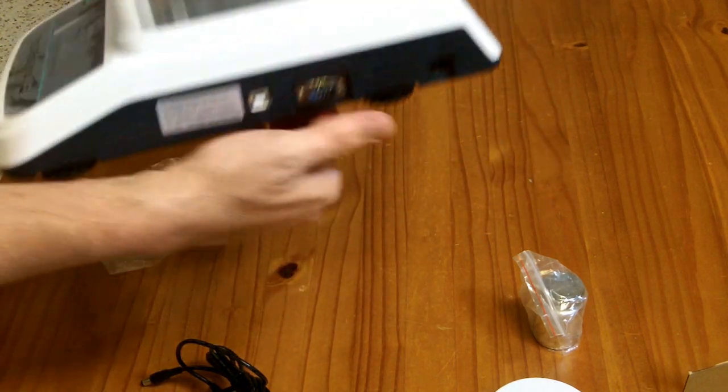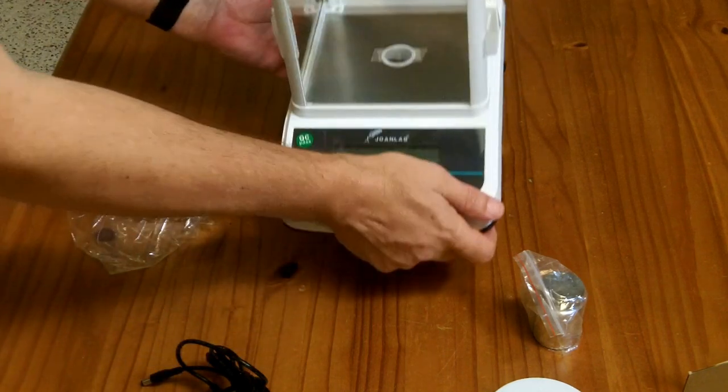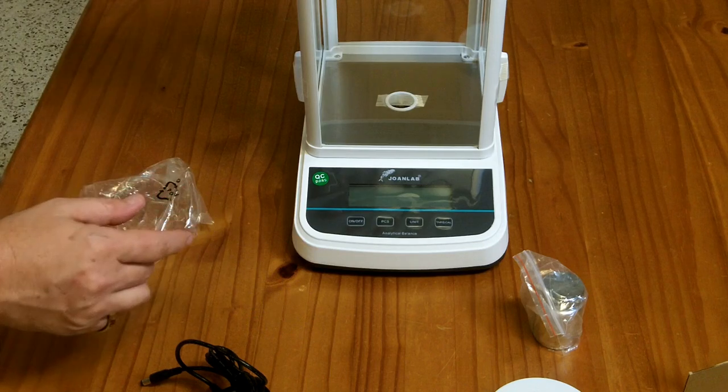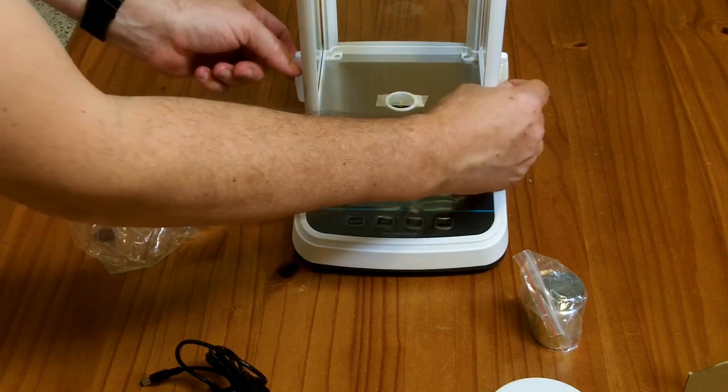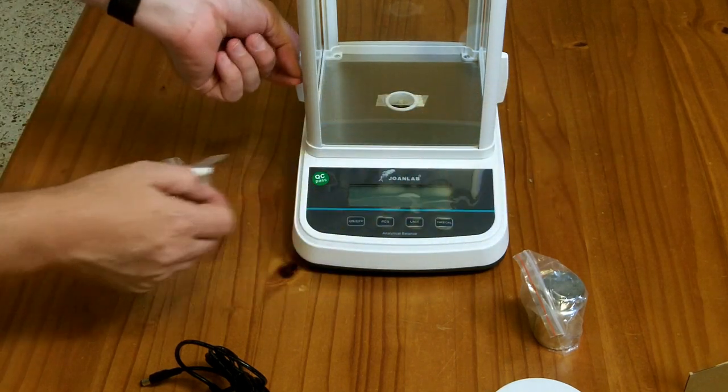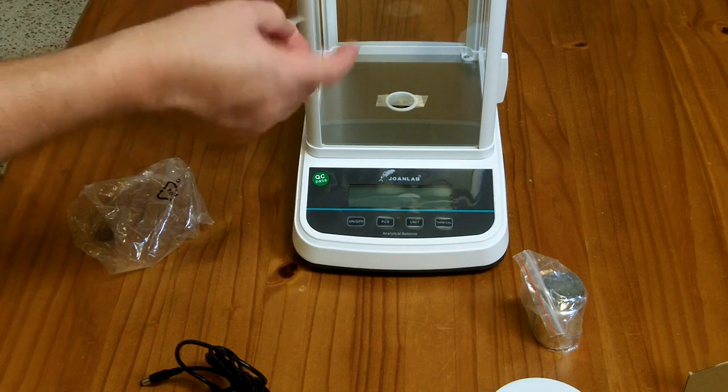You might notice that each of these feet have little knobs on them so you can spin the feet to level the scale. So if your table is not level you may need to level the scale. Now it is an enclosed scale because a little bit of air current can affect this. And it has three sliding windows and they're held closed with this tape for shipping.